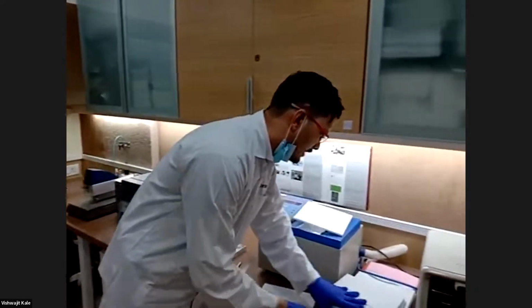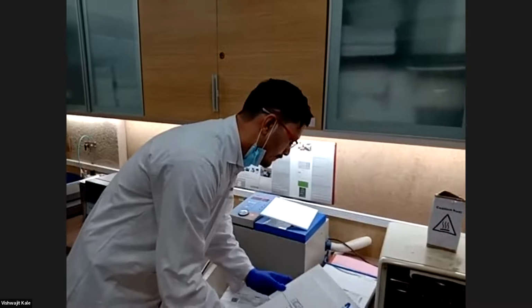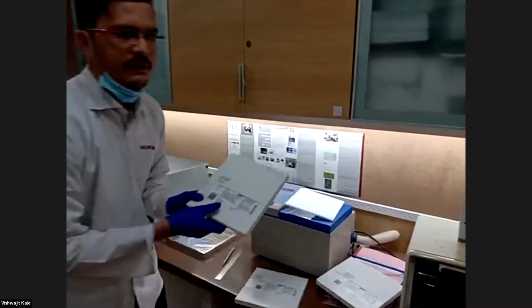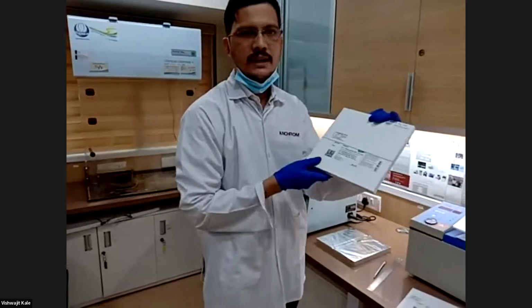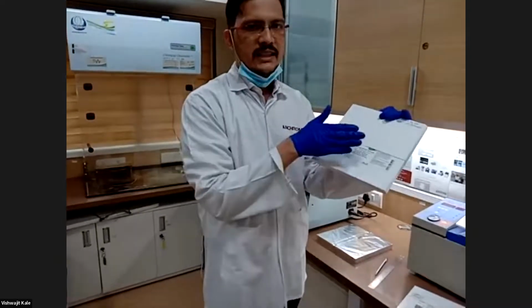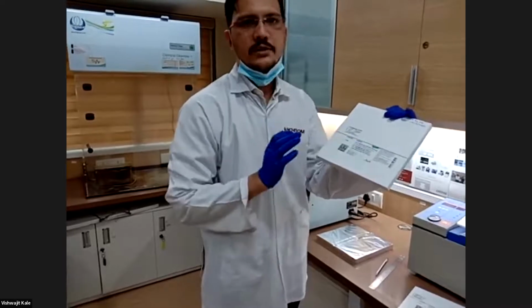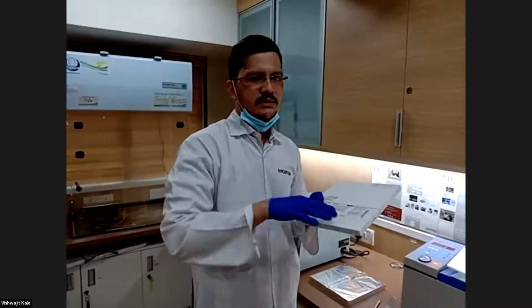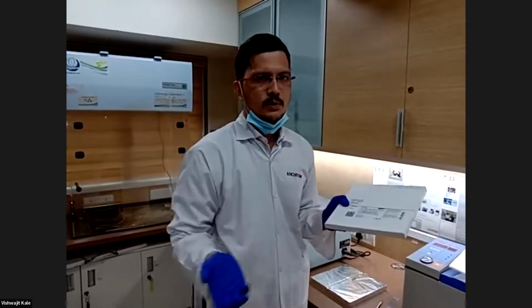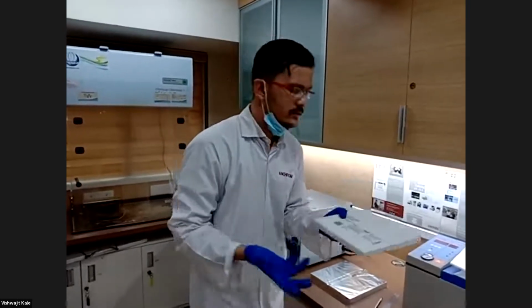There are many different types available. So this is 1.0559, a reverse phase TLC silica gel plate, also available. These plates are coated with silica gel along with C18 hydrocarbons, which are non-polar in nature. So we can make our stationary phase more non-polar than the mobile phase. Reverse phase HPTLC also we can perform.